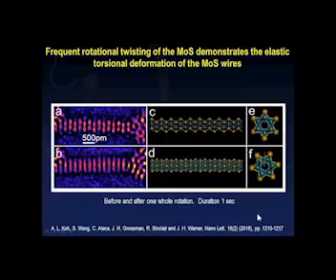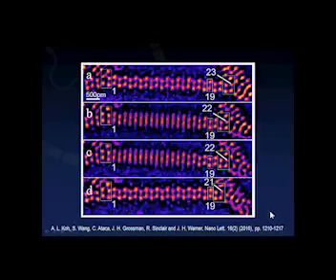So what we found using a combination of the experimental data and simulations is that the wires have a rotational twisting motion, and we could see that it takes about 1 second for the wire to undergo a whole rotation. And also, we were able to analyze consecutive frames, such as this panel of images over here.